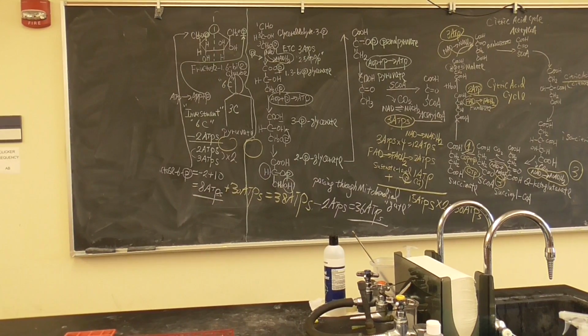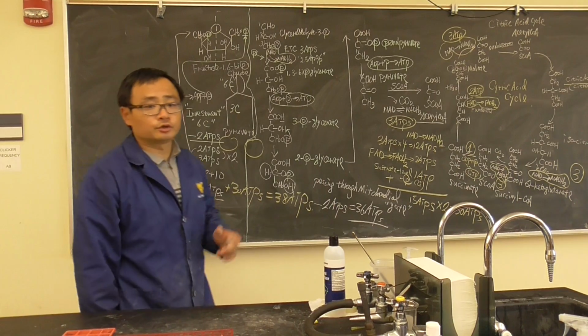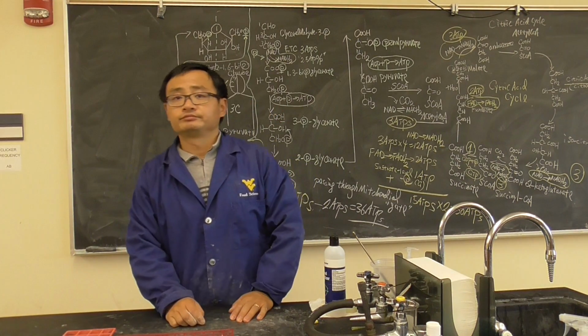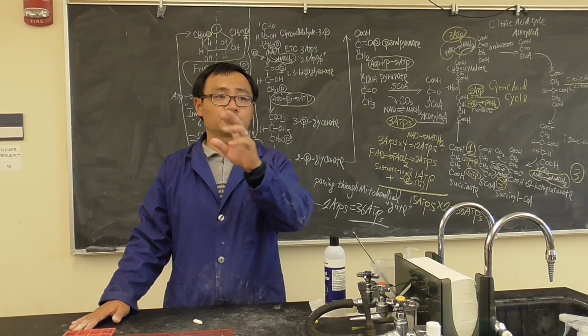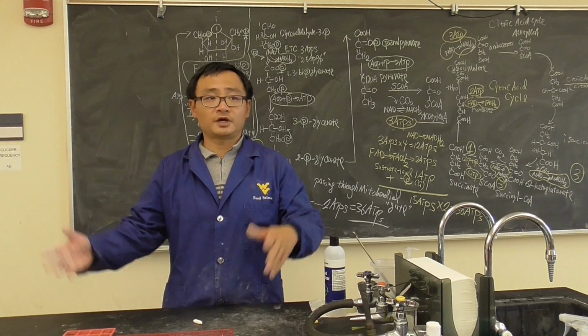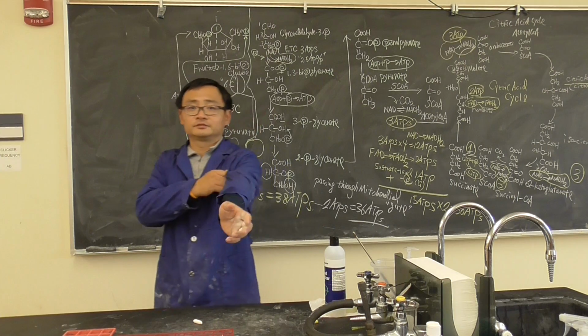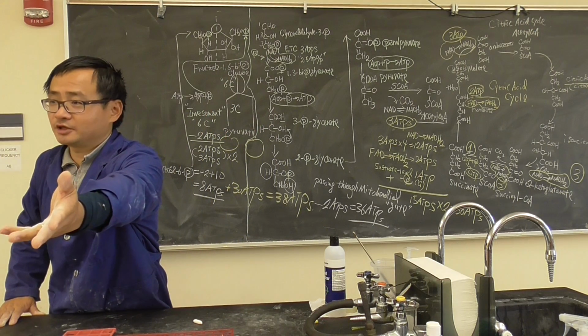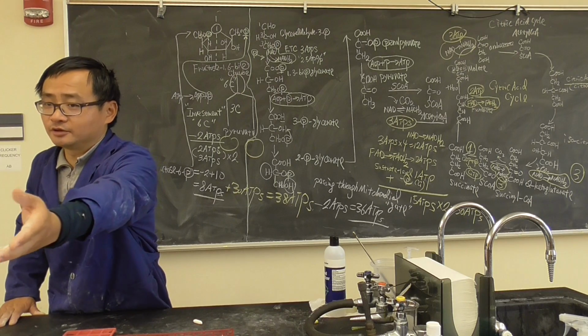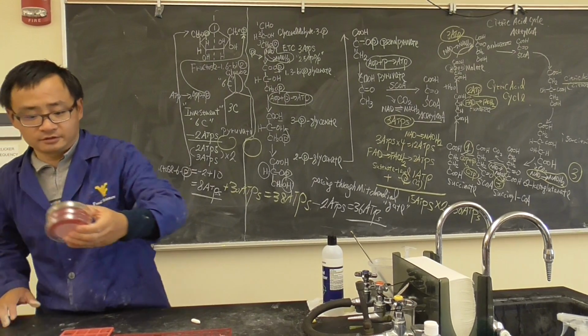So we had a lab section do the urine culture, what it looks like. I would love to first of all go over somebody did your clinical sample. Do you have the sample? Can I have it? Let's just see one sample. Okay. Patient number 1.